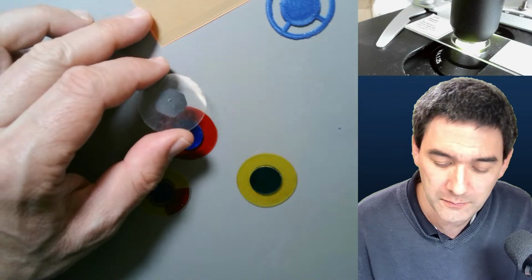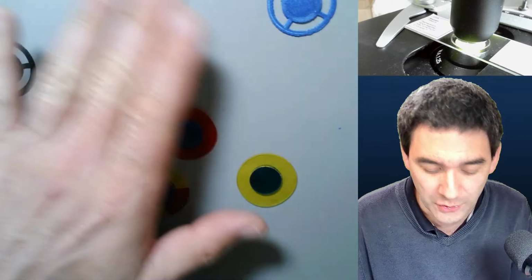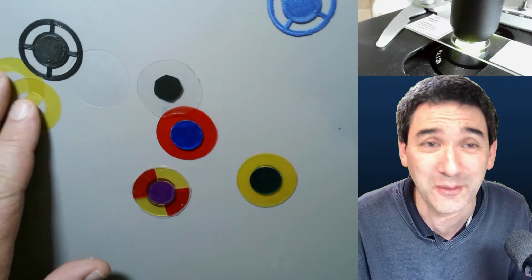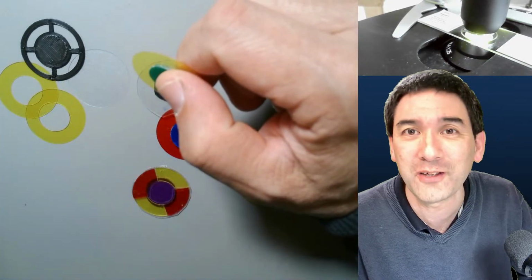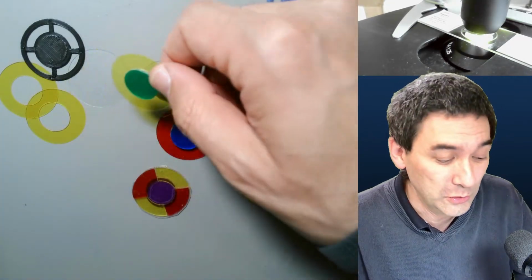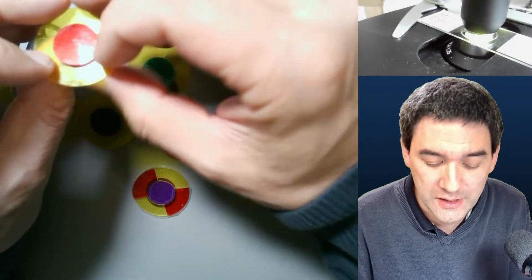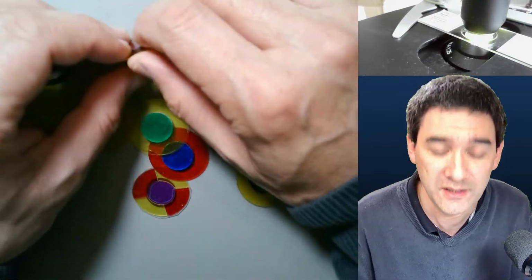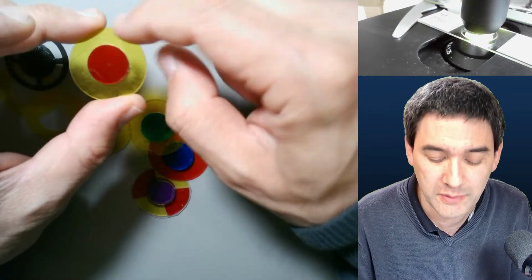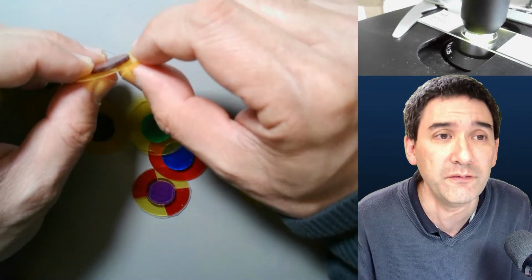So maybe, yeah, I was also sent a link where these things can be bought on Amazon. But those filters here I got as a present, and I would like to say again a very big thank you to Hadrian, also in the chat here, who made them and who told me that he used a puncher. Yeah, you can buy those. With a hammer you punch them out. And he suggested that if you want to do that, you have to really make sure that you're doing it on a very hard surface, so that you are able to punch it out quite nicely. And you see over here that some of those filters can also be fairly thick and fairly solid. Okay.